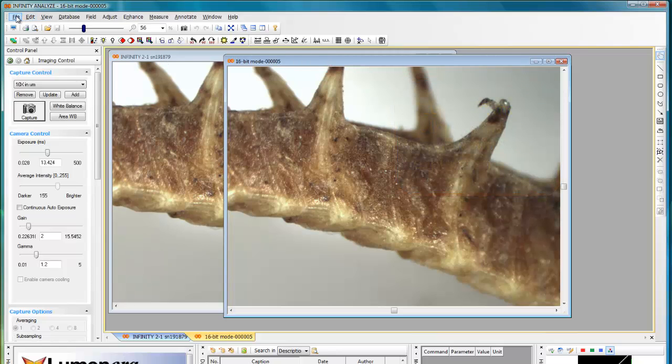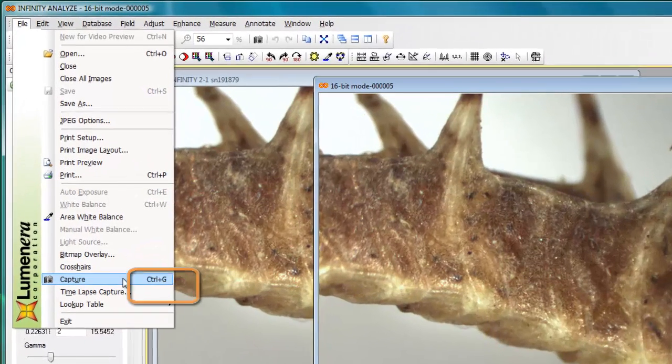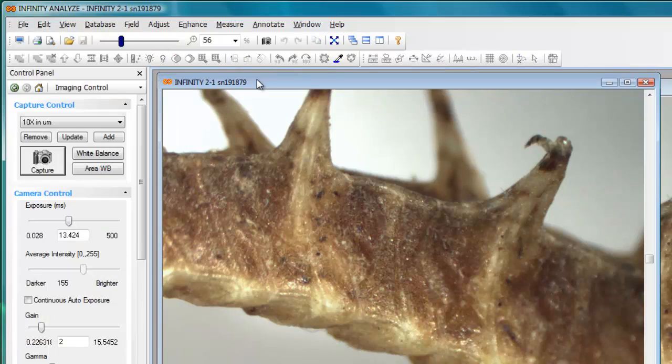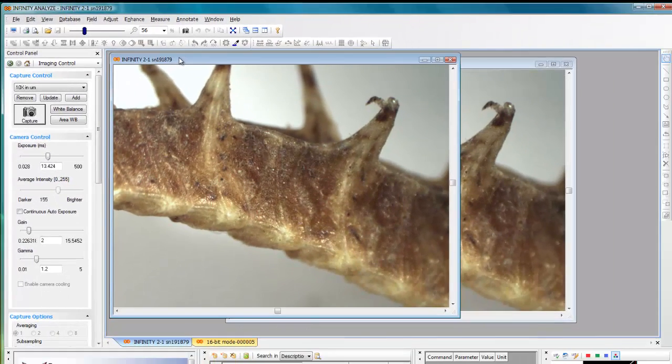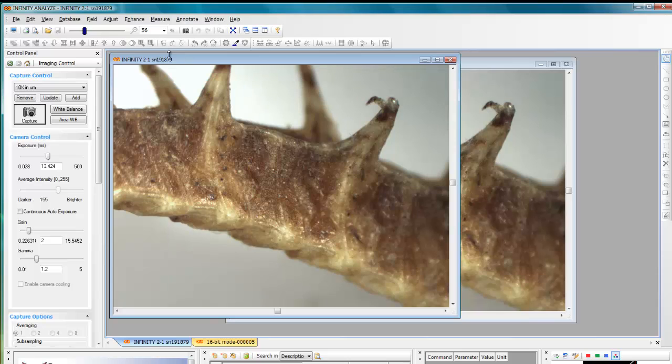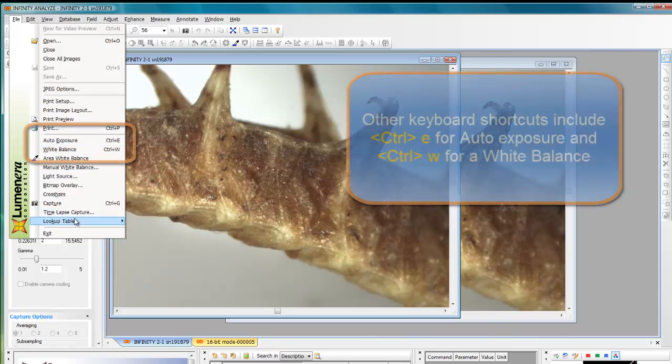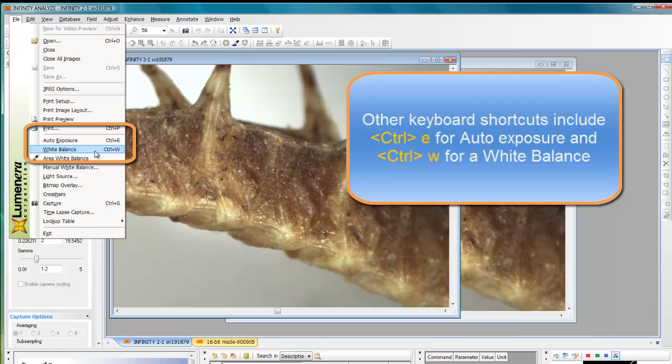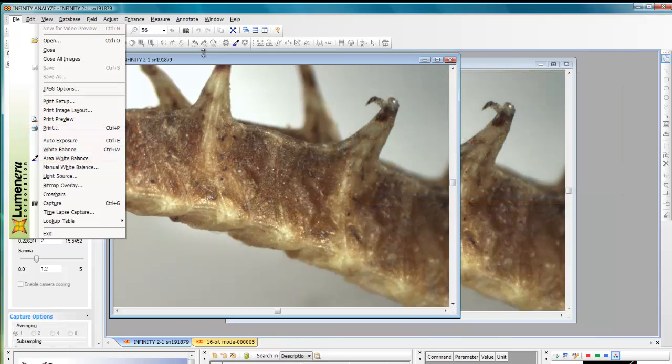The control G function, which is listed here and showed up as a tooltip, is important if you wanted to use your macros in conjunction with a foot switch. A programmable foot switch allows you typically to program a sequence of keyboard functions. So knowing that the control G will do the capture for you is important if you have a multi-button foot switch. You can also program in things like auto exposure with a control E or control W for a white balance.